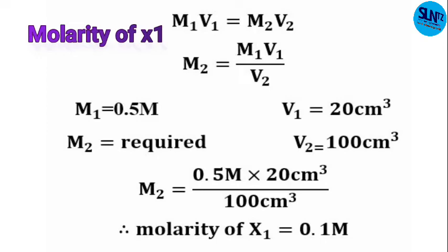We have been provided X as 0.5 molarity, but we have been given a task within a procedure to perform dilution. So the concentration of X is 0.5, and after dilution we are supposed to find another concentration after adding water to that solution of X, which is called X1.